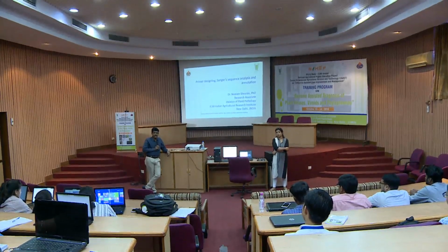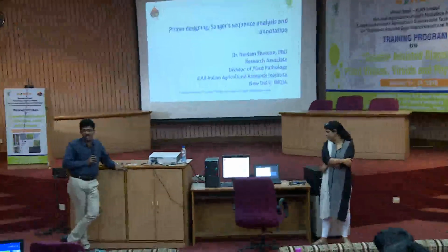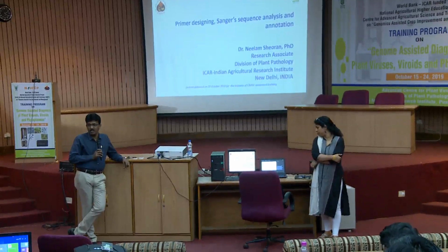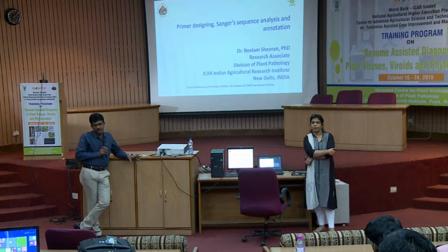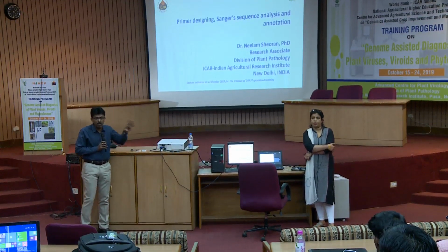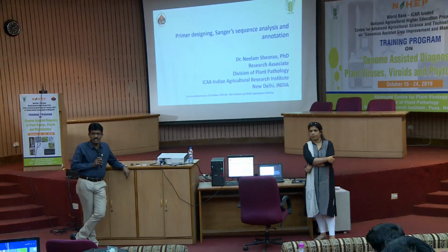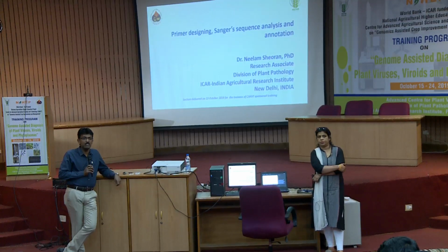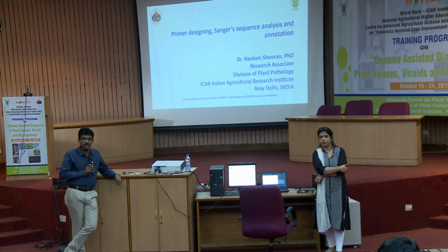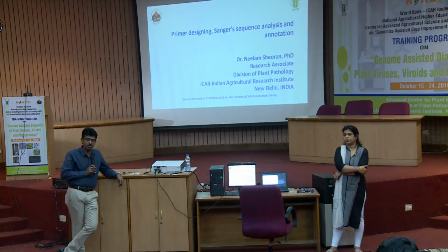Follow her lecture and also the demo that she is going to give here with some sequence examples and using some of the software that is being used for sequence handling. The highlight of this lecture would be basically on how to handle the software. So follow that, and I'm sure the students sitting here and in 2 other universities will enjoy this lecture. And if you have any doubts or clarifications, we'll take up all those questions towards the end of this lecture. So I'll invite Dr. Neelam to moderate this session on genome sequence analysis.